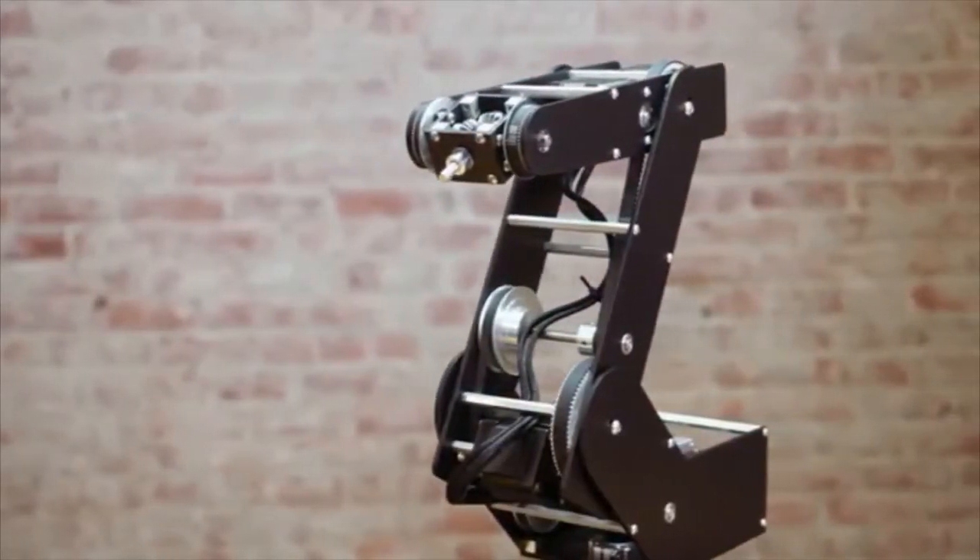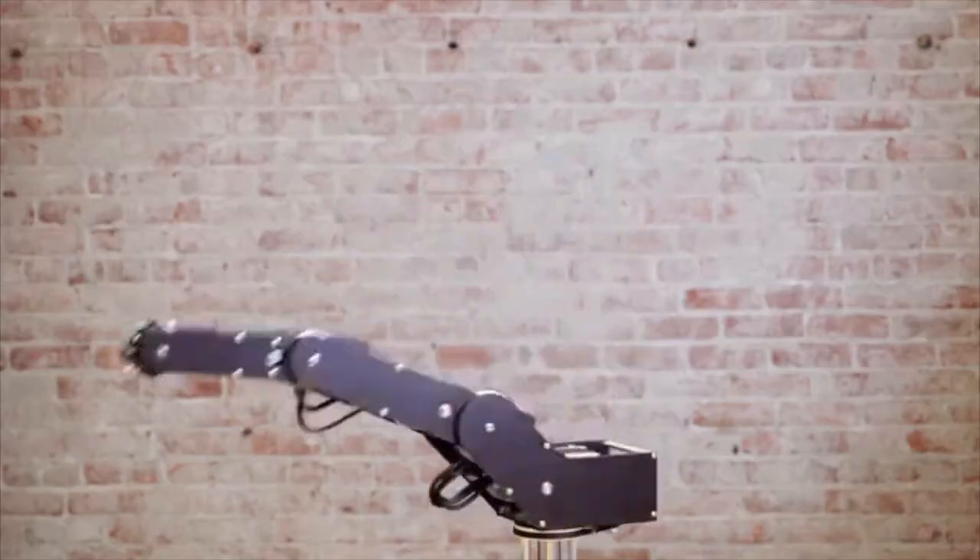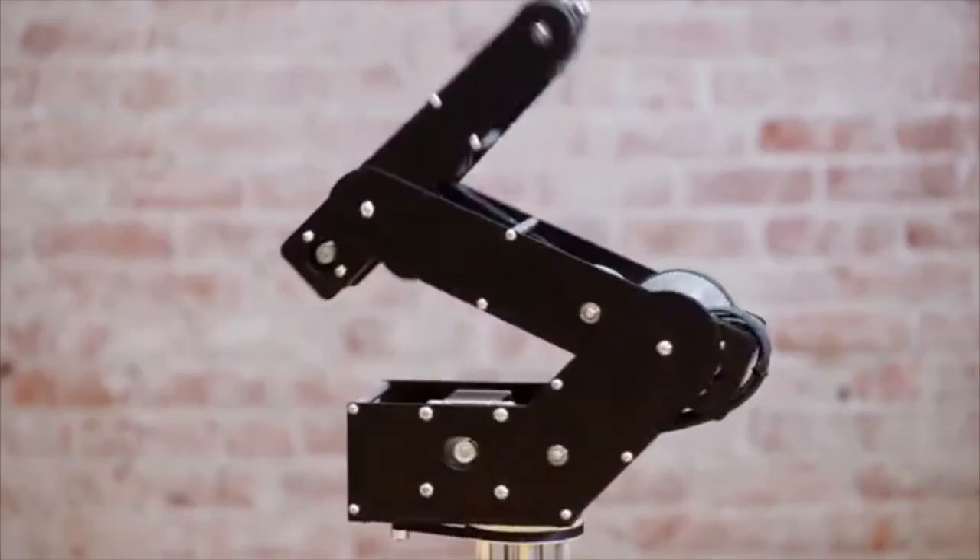The current version of Dorna is the result of many rounds of iterations and prototyping, and we think we have a fully functional and stable design. Hi, my name is Sadak and I am the founder of Dorna.